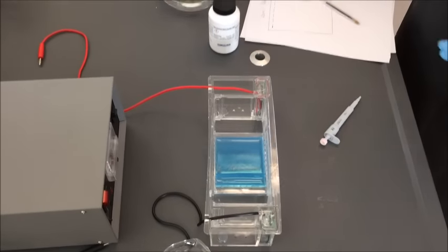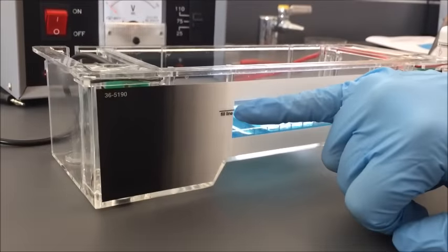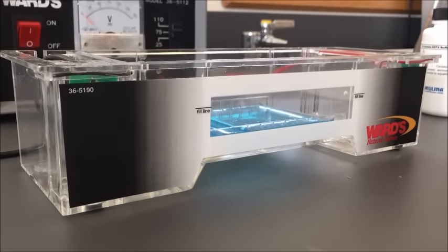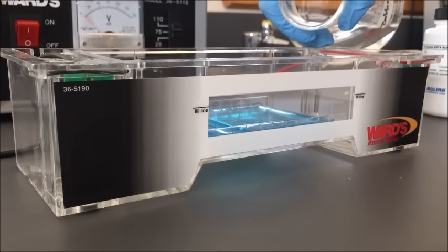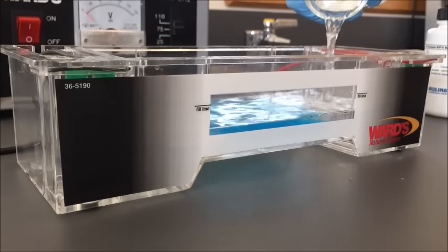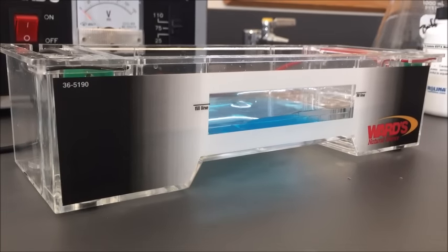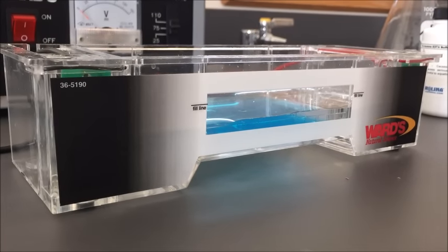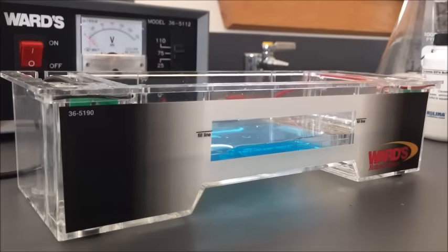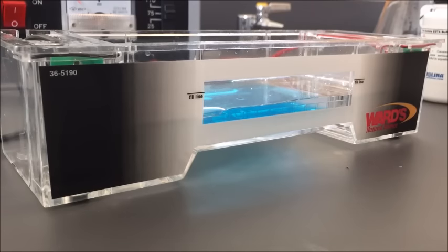Now that I've got it set up, I'm going to add my buffer. On the front of your chamber, there is a line labeled a fill line — this is the maximum amount of buffer you want to pour in. The minimum is enough to cover your gel. We do not necessarily have to go up to the fill line, we just want to make sure we don't go above it. If your gel floats a little bit or detaches slightly, that is fine — you can still load and run it.